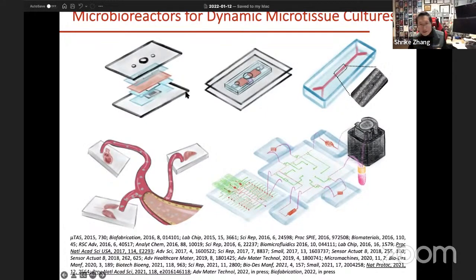But also, as mentioned, we can start to link these different organ-on-chip devices together in different ways to allow their interactions in vitro, right? So these are basically allowing you to really look at how these different organs are potentially interacting without being in the human system, and then how, if you put the drug molecule in there, these different organ systems are also interacting with different drug molecules as well.